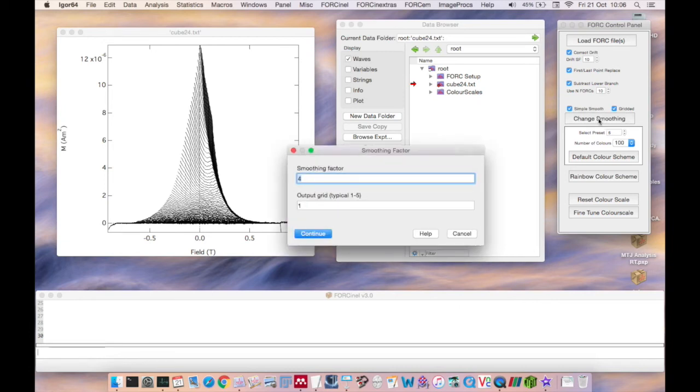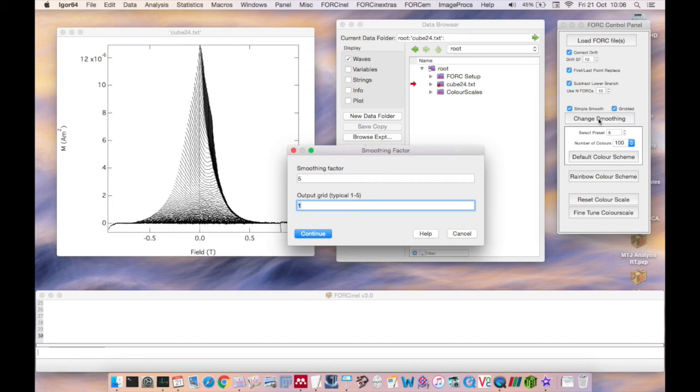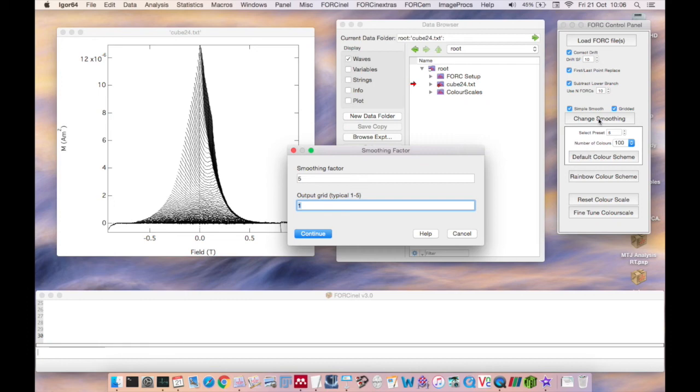You'll be asked to enter a single value for the smoothing factor and also a value for the output grid factor. This is a new feature of ForkNL3 and it allows larger datasets to be processed much more quickly than before. An output factor of 1 means that the fork distribution will be calculated at the highest possible output resolution which corresponds to the native resolution of your measurement. A factor of 2 will reduce the output resolution by a factor of 2, etc.